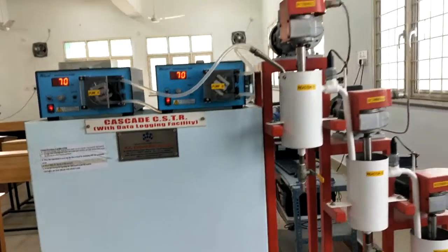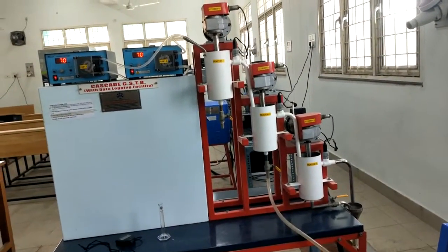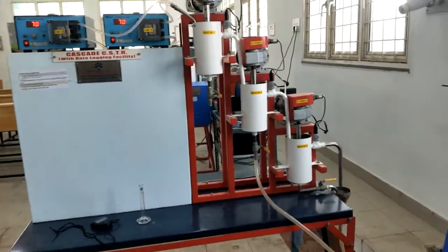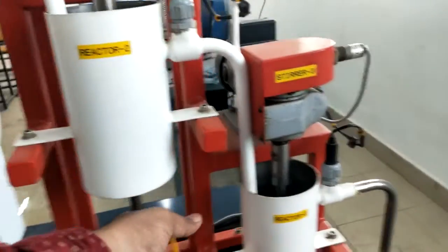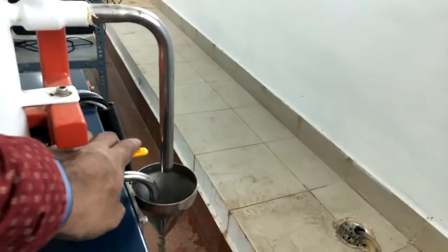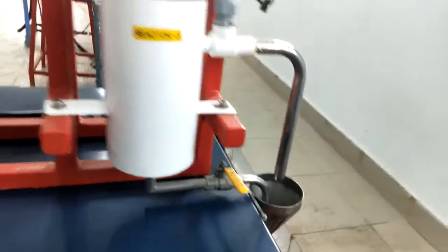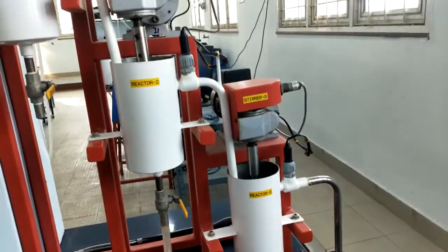So we will wait for another 8 to 9 minutes for the liquid to flow from the tanks. We have to remember, after emptying the tanks, we have to close the valves. Now here also we have to keep the tank closed. Then only water level will increase, right?